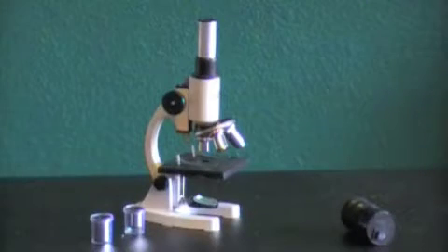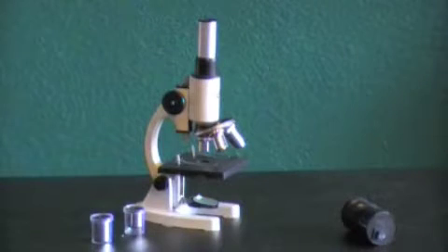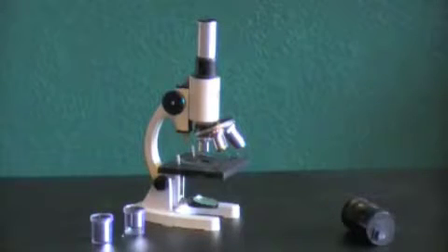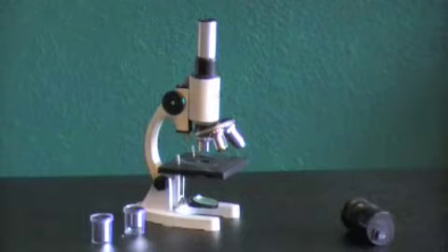Alright everyone, while we're waiting on our brine shrimp to hatch, let's look at our microscope. What you have here is called a compound microscope. The word compound means multiples. It means that there are two different lenses that you're using for this one.